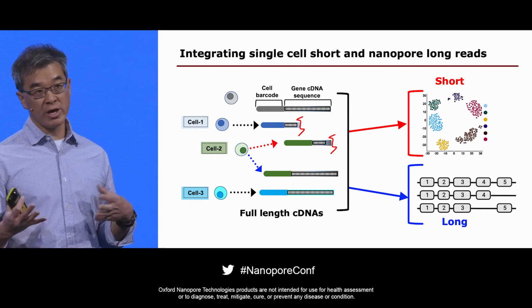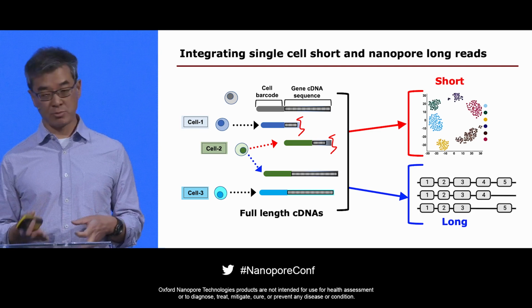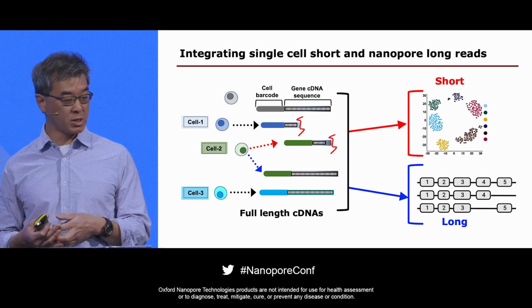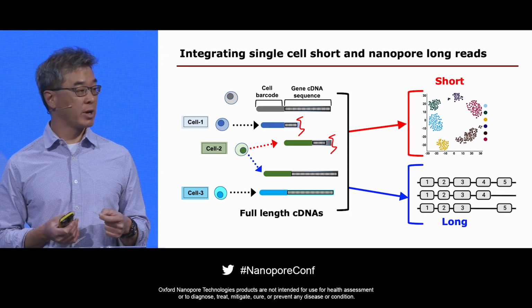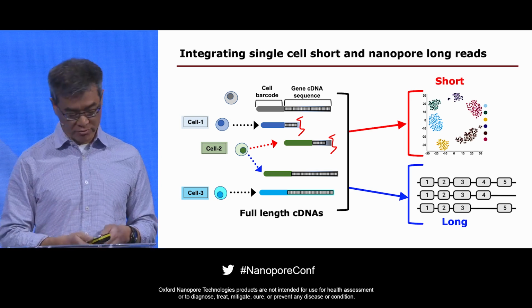One way of initially doing that, through the two pilot studies and proof of concept experiments that I'm going to describe, is basically taking advantage of existing methods, particularly using traditional short-read sequencing, but then really starting to leverage the long-read advantages that give you the ability to query entire transcripts that can be assigned to single cells, and thus pull out these other additional features that are available.